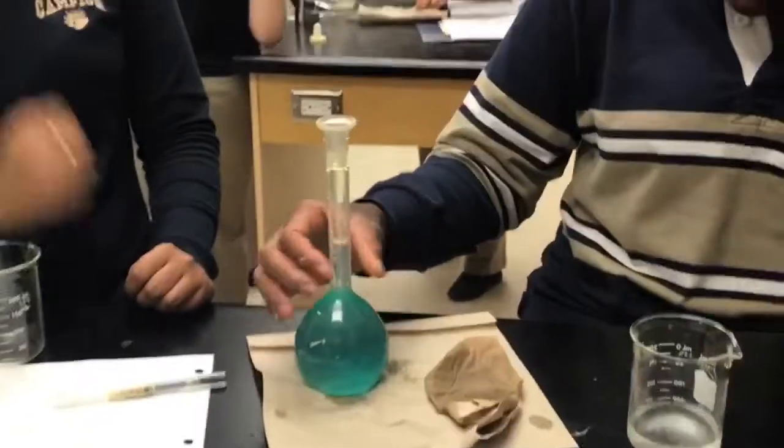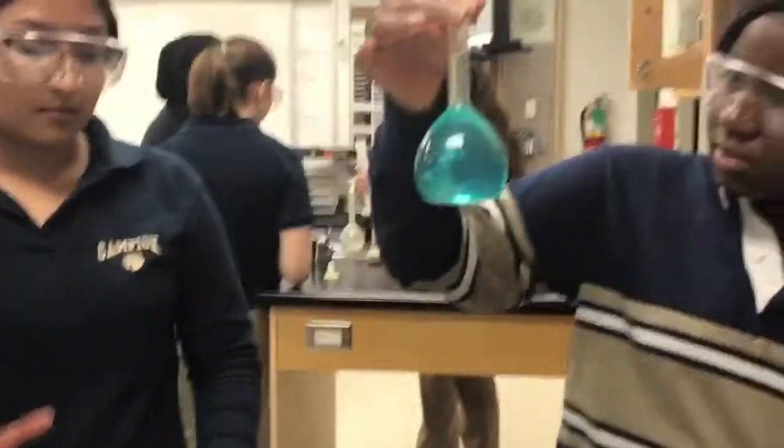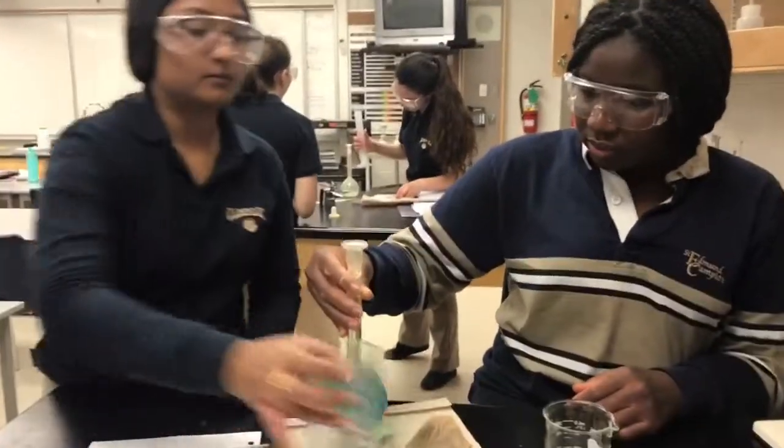Good. We have 0.1 mole per liter, exactly 250 milliliters of CuSO4. Here we go, people. That was step one. Tashi, what's going on here?